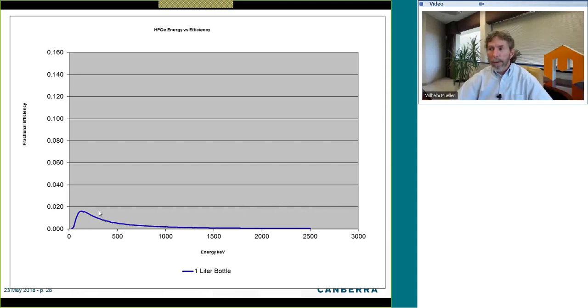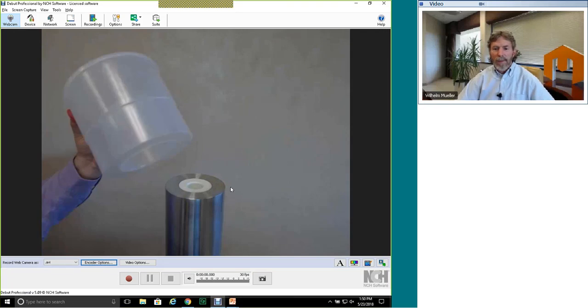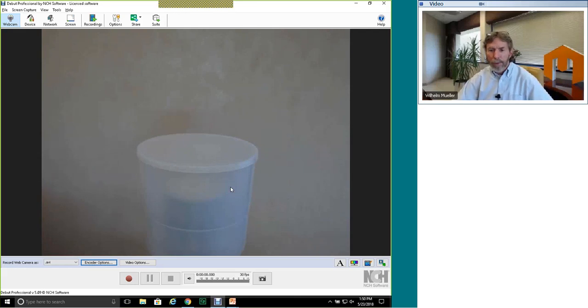If we want better detection limits, we can change a counting geometry to something that we know is better. For example, a large Marinelli beaker. Will, if you please. By the way, this is a very large Marinelli beaker. That's a 4 1/4 inch end cap on that sage well detector to accommodate that 28 millimeter well. So this is a 4 liter Marinelli, but the principle is pretty much the same.